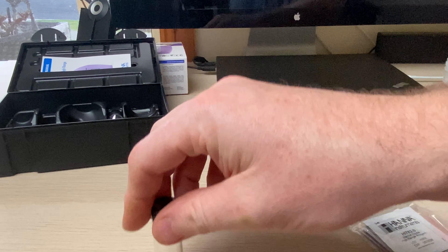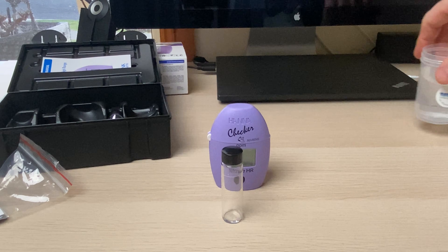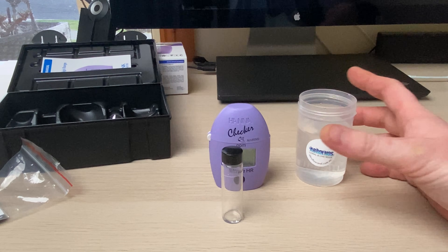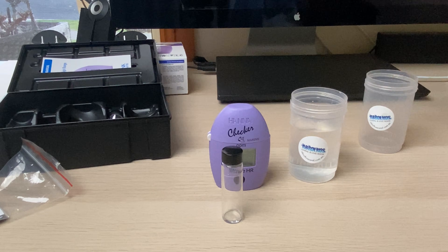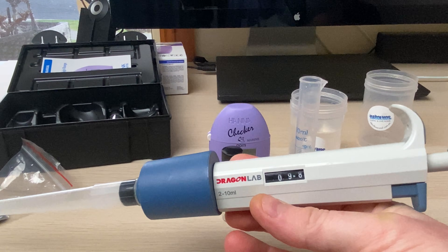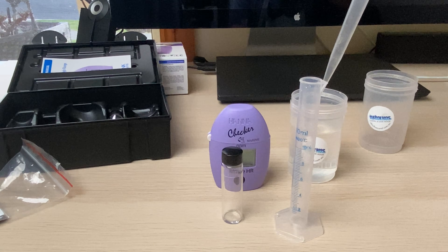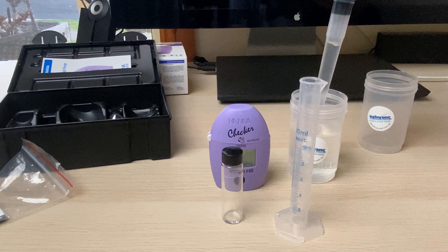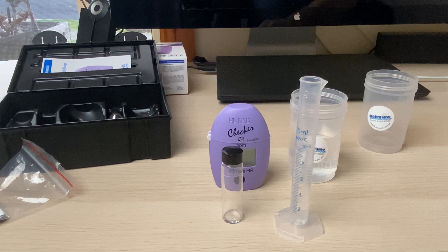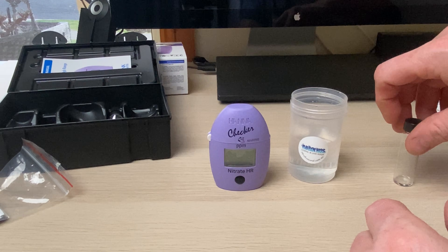Essentially we get the checker, we grab a cuvette, and a reagent packet. I've got some tank water here in one of these little containers — I use the Abrolos containers that corals ship from WA in, perfect to reuse for this. I've also got a little measuring cylinder and my adjustable pipette. I've got it set to 9.8 milliliters, not 10 — I just want to calibrate it because I think it's been putting a little too much in lately. Checking now — 10 milliliters of water, so we know that's good.